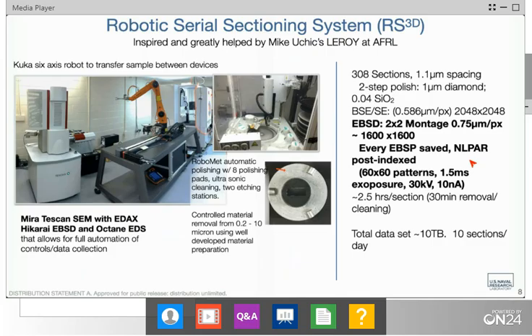We do use fiducial marks to help with the loading and unloading. Just the stage itself, we're finding that we usually have an error of somewhere around 100 to 200 microns on positioning. It really can depend a little bit upon how we design these pucks that we're attaching our samples to.